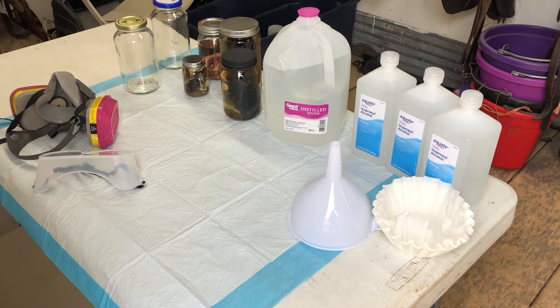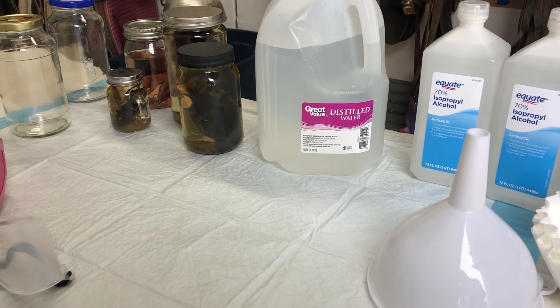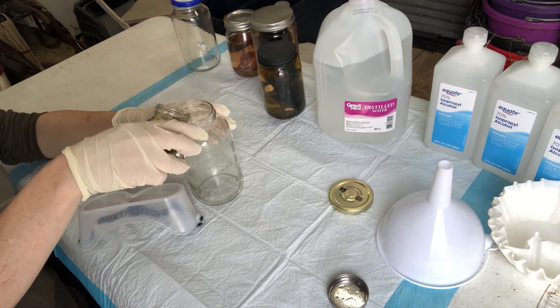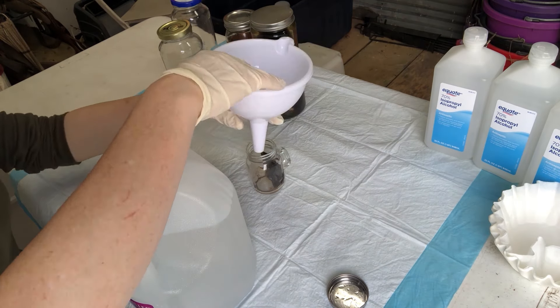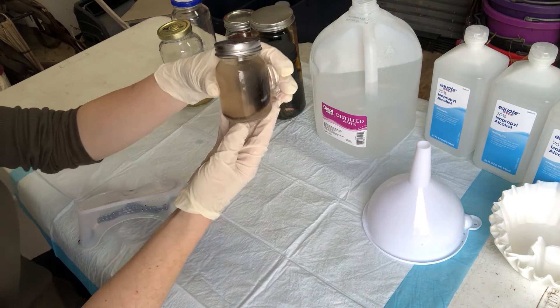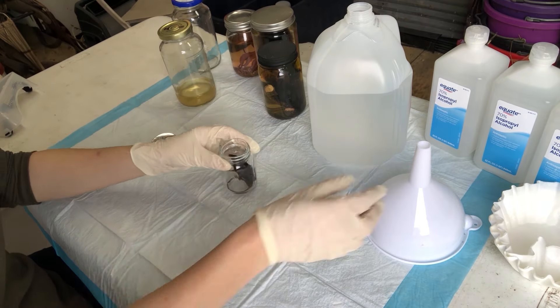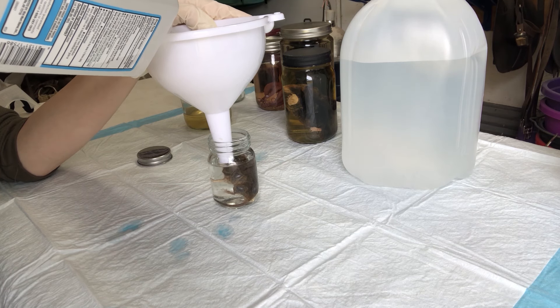Once your critters have soaked long enough, pull out your materials again. The new items on the table are isopropyl alcohol 70% and distilled water. I've also got some coffee filters to filter used dirty formalin so I can save it for another project. Now I'm pulling out my mouse and pouring out the formalin — there's also a rock in there I used to hold him down. Now I'm using the distilled water to clean and wash him. Give him some good shaking because you want to get him as clean as you can — see how dirty that water became almost instantly. I gave him two rinses with the distilled water, then filled it up with the isopropyl alcohol, which is the final solution.